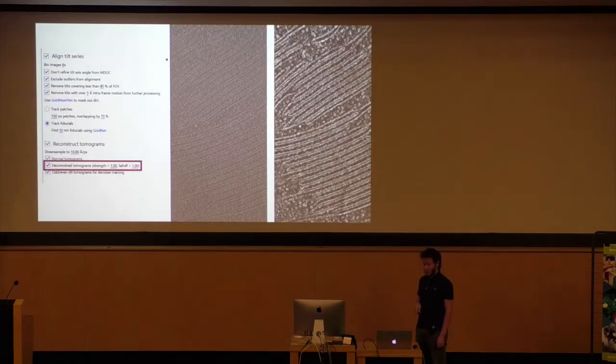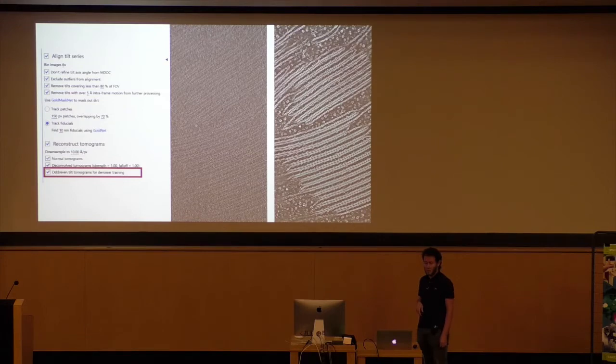And I already mentioned it can also automatically deconvolve the tomogram to boost the low resolution signal to get a look that is more like the Volta phase plate. And if you reconstruct all the odd and even tilts and train a 3D denoiser on them, then you get an even nicer result than with the deconvolution. This is the denoised tomogram on the right.